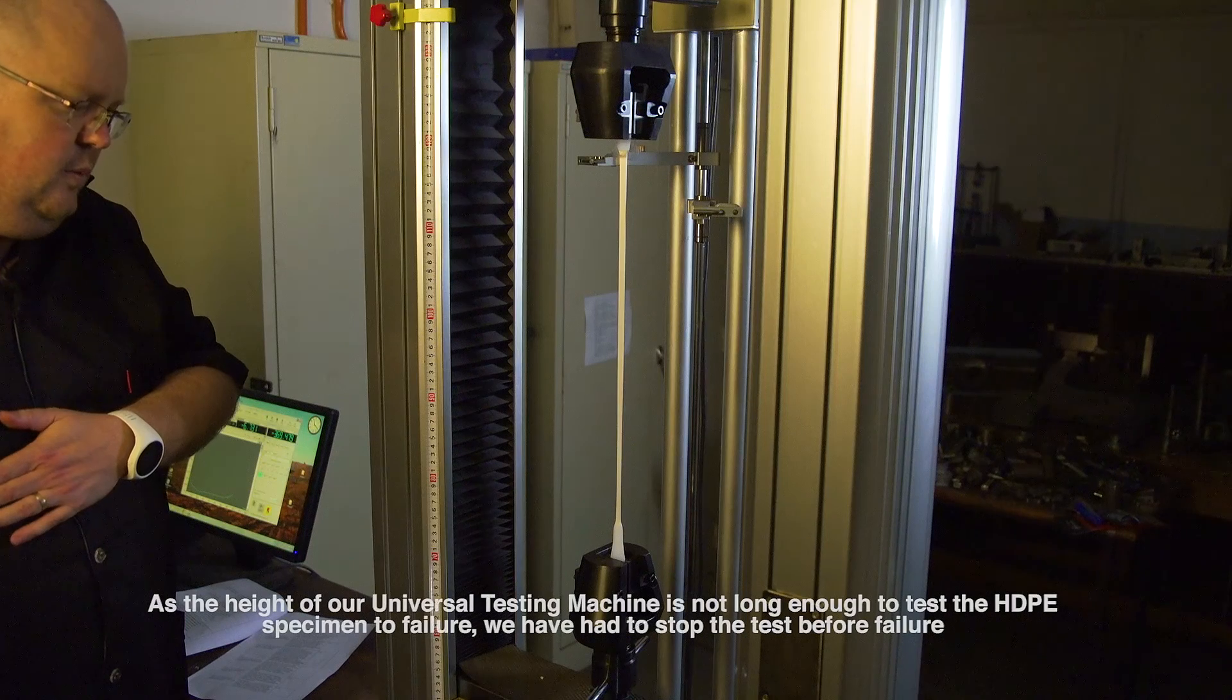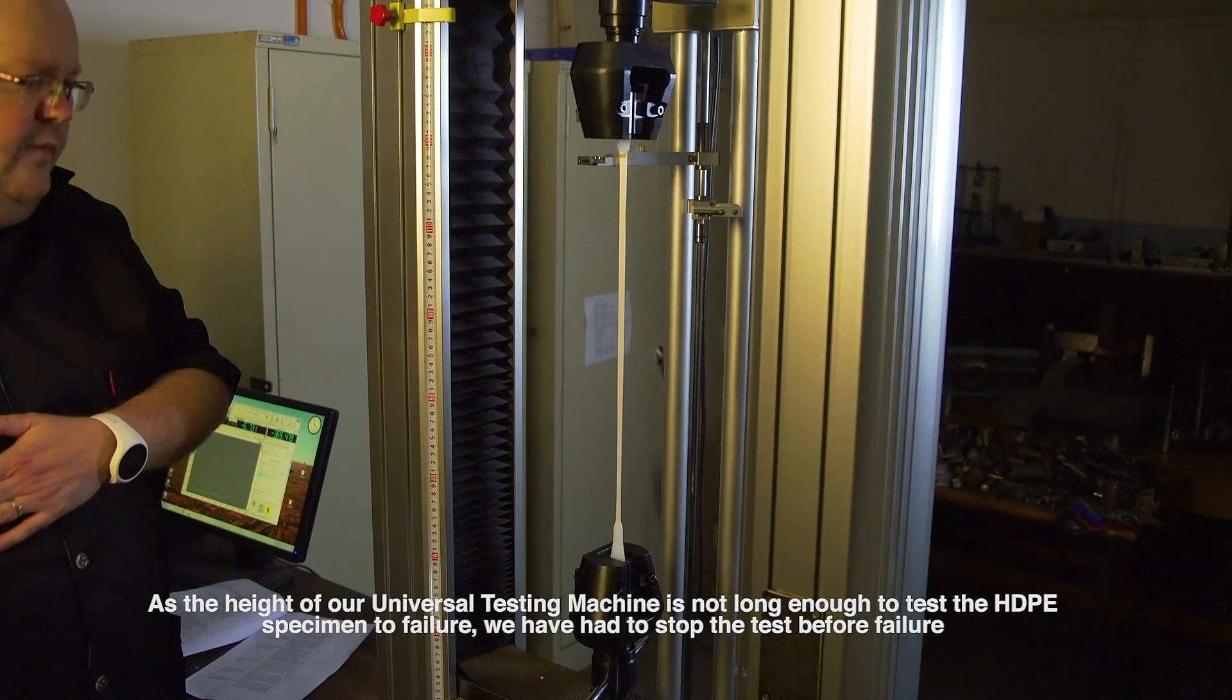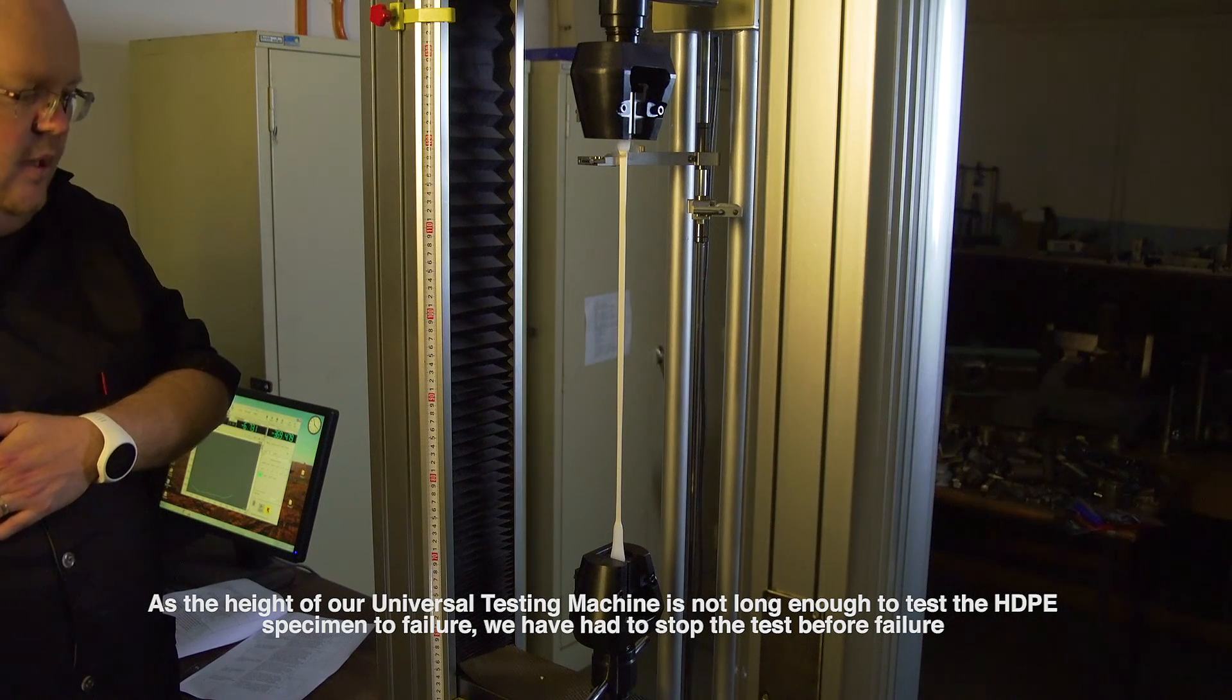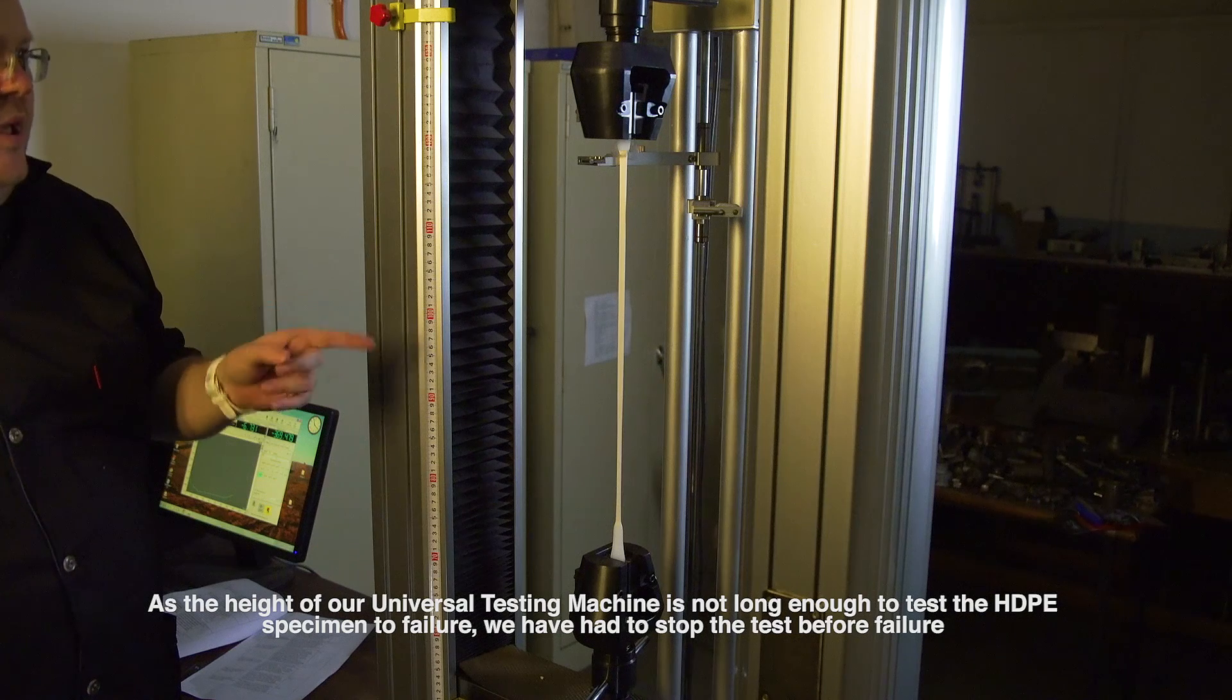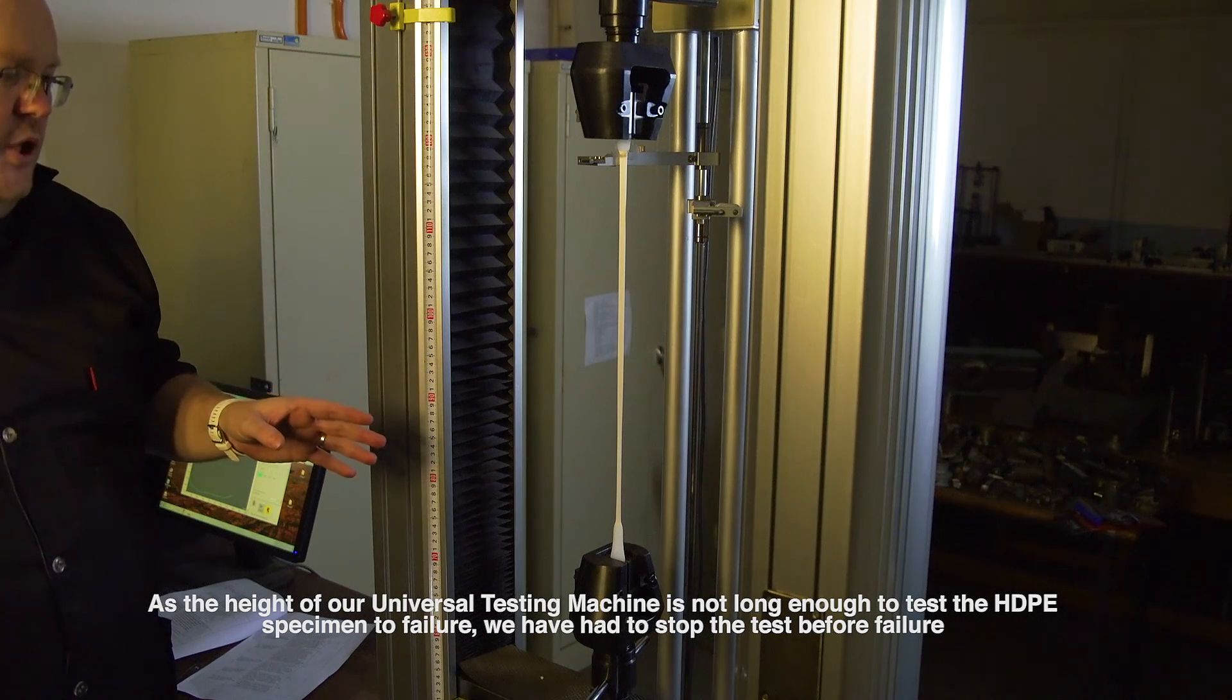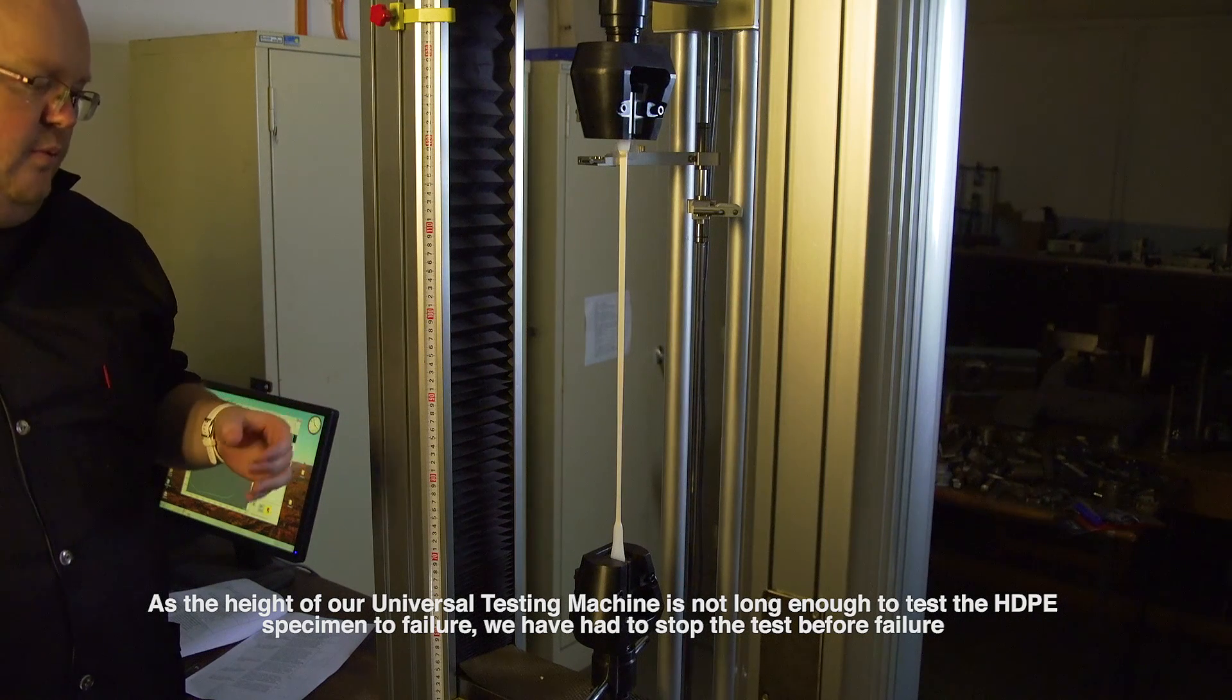All right, so we have spoken in class about the fact that the total deformation of a sample before failure is the sum of the elastic and the plastic deformation. As you can see now, this HDPE sample hasn't actually failed, but this is a good way for me to show you the spring back due to the elastic recovery of the sample when I release the grips.